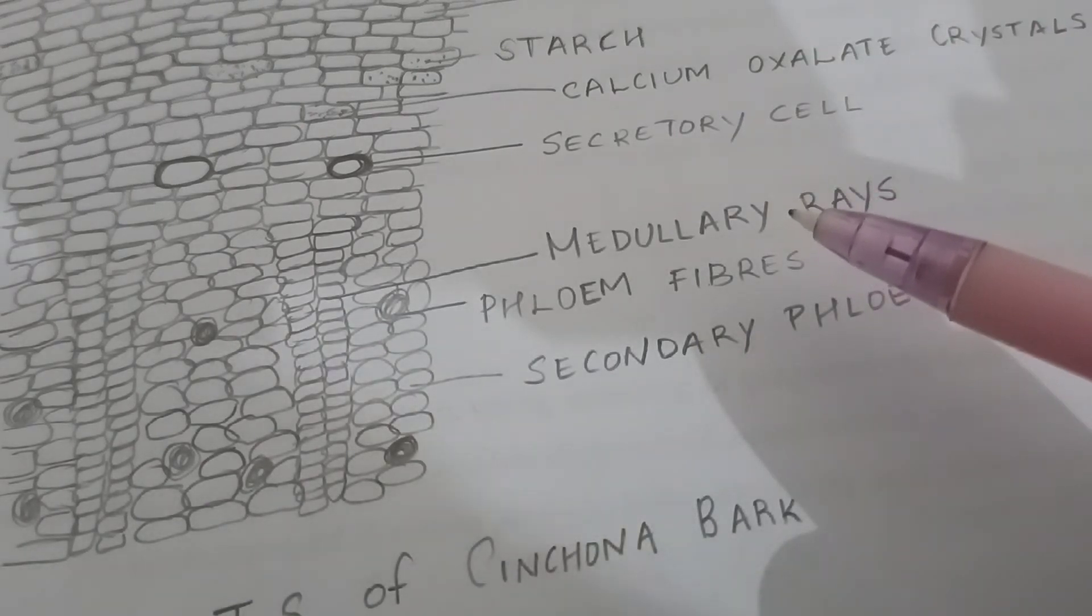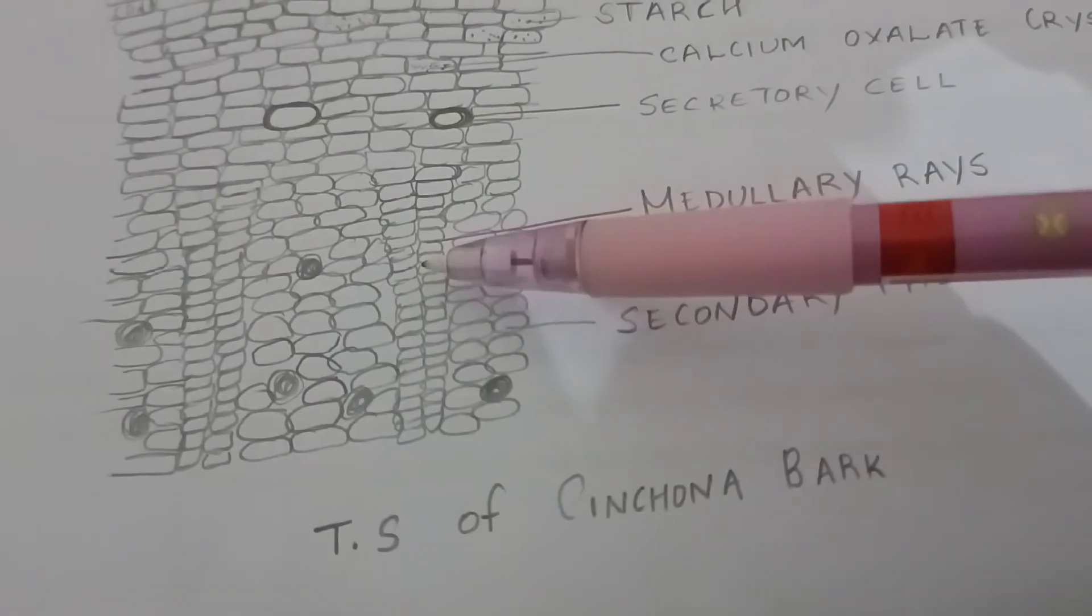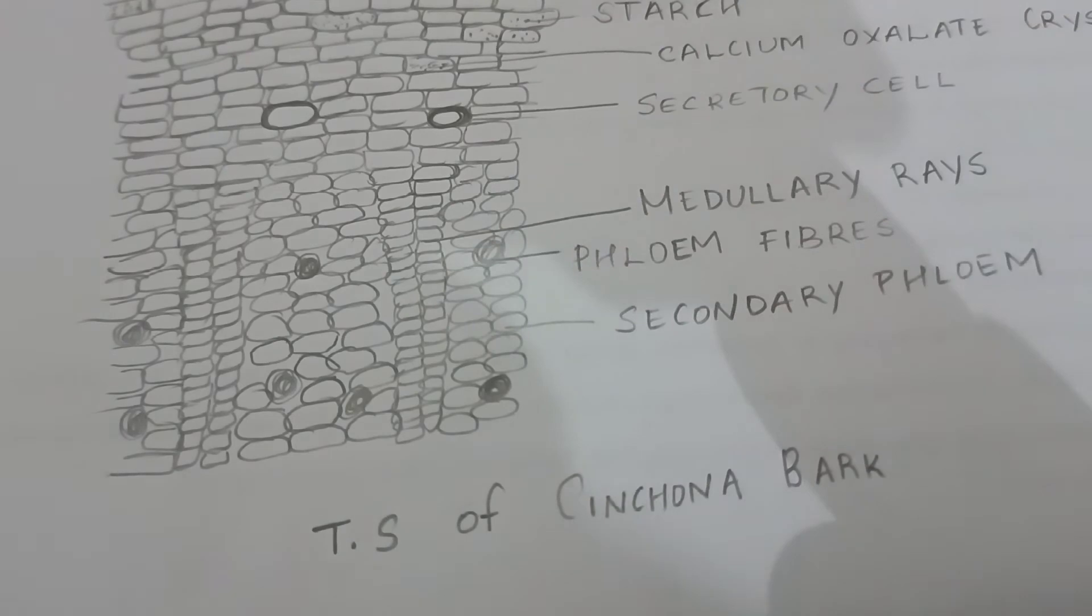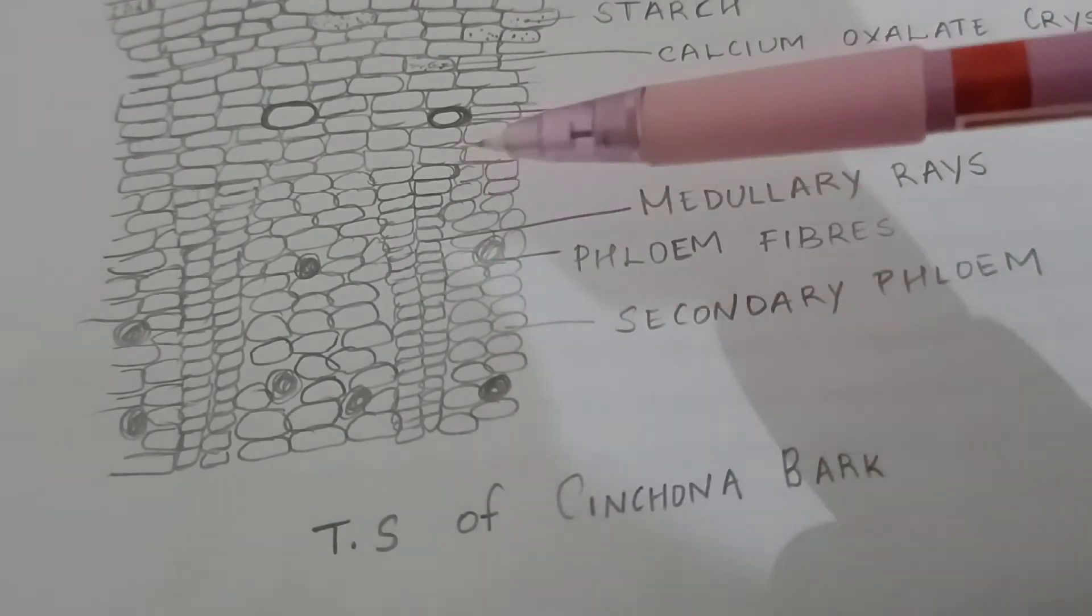Medullary rays are 1-3 seriate. They extend up to the cortex, cells readily elongated and contain starch grains.